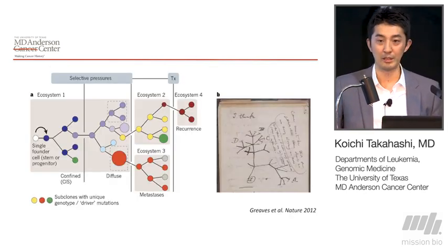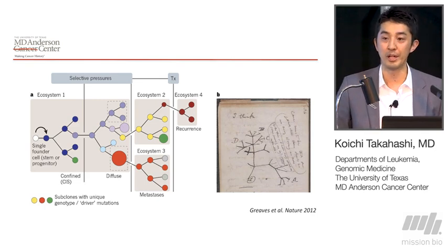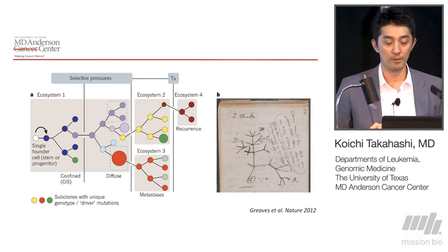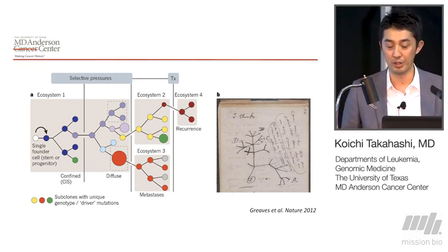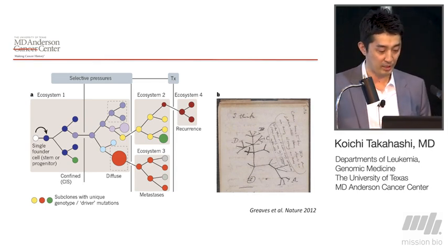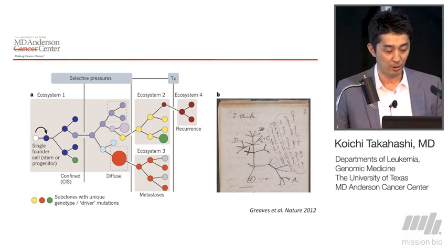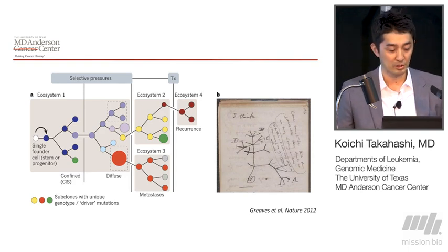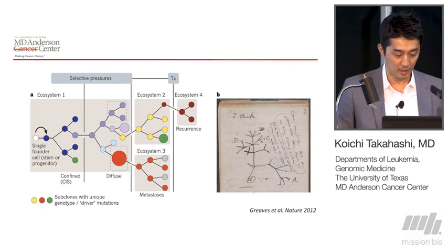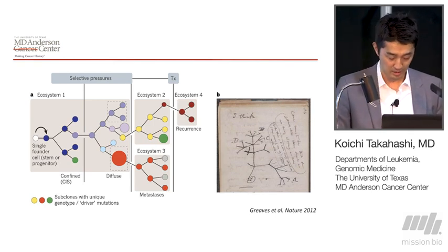And this is really important, because clonal heterogeneity is a reflection of how each clone evolved under the selective pressure of the tissue ecosystem or under the therapeutic pressure from cancer-targeted therapies. So profiling clonal architecture with precision at any time points, like here or here, enables us to build the phylogeny of how the cancer cells evolved. So it is really important to characterize the clonal architecture of the cancer cells with precision.